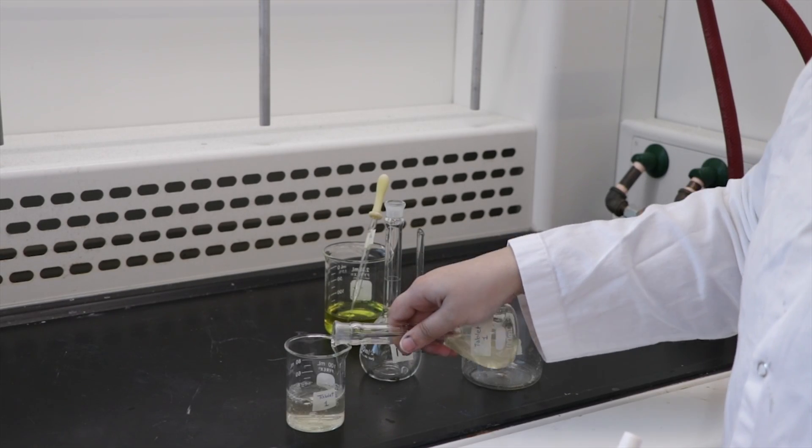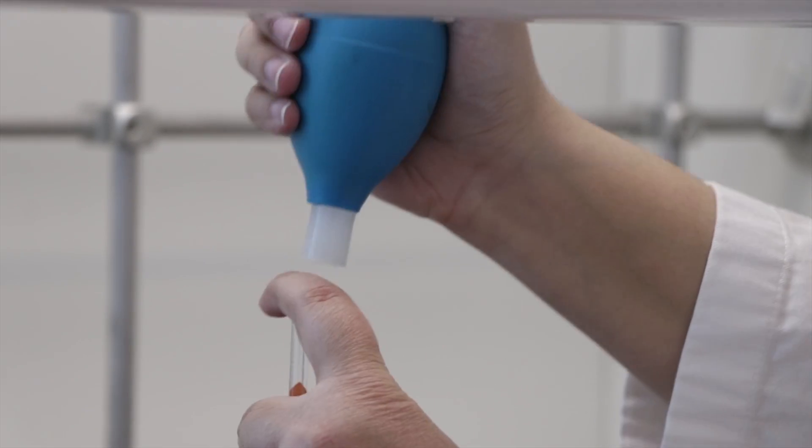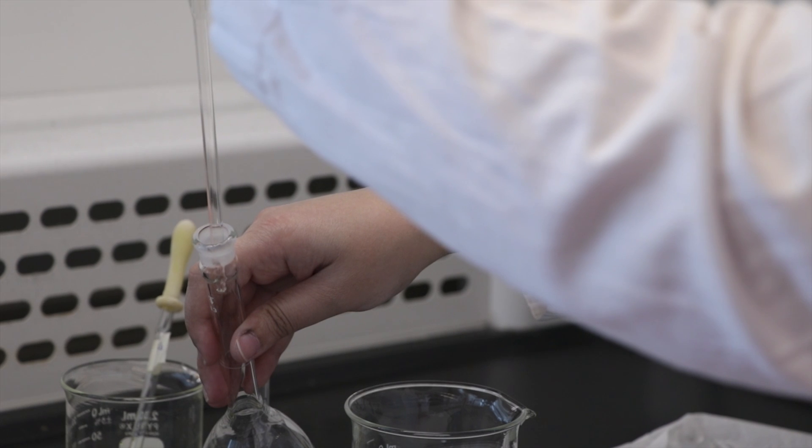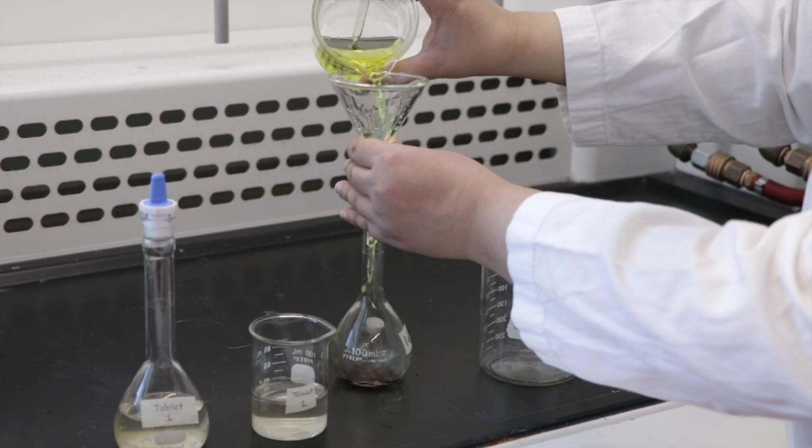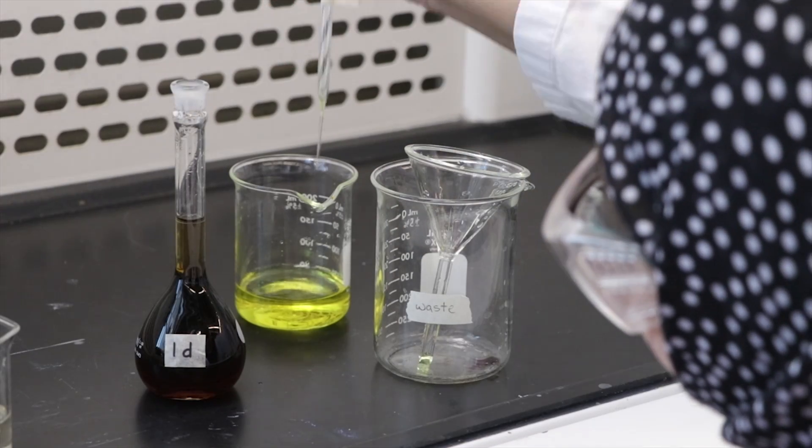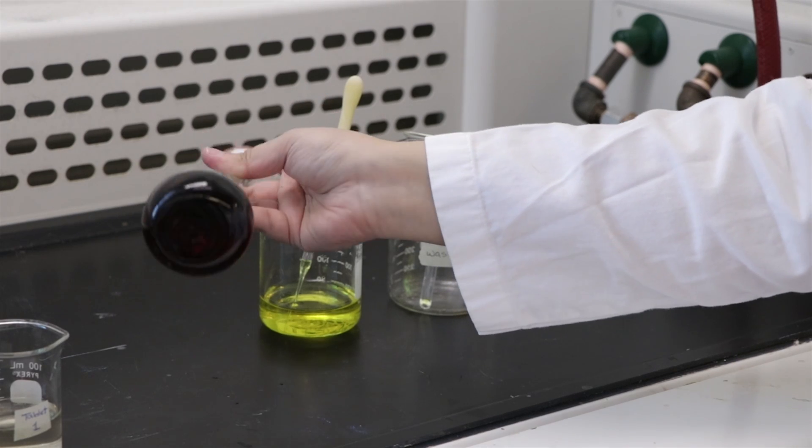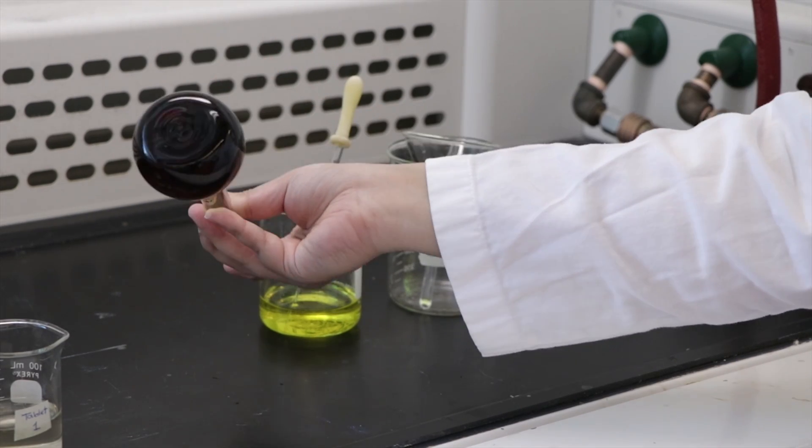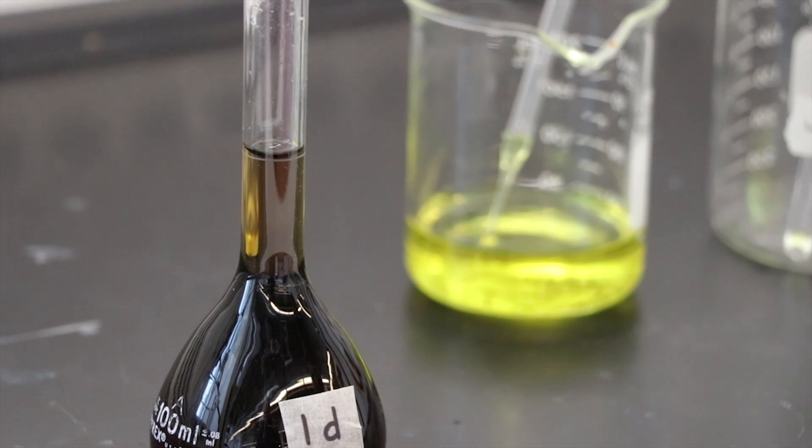Next, pour the tablet sample into a beaker. Using a 2 ml transfer pipette, pipette 2 ml of the sample into another 100 ml volumetric flask and fill to the mark with the FeCl3 solution. After inverting the solution, measure the percent transmittance of the diluted tablet sample immediately. Repeat these steps for the remaining two samples.